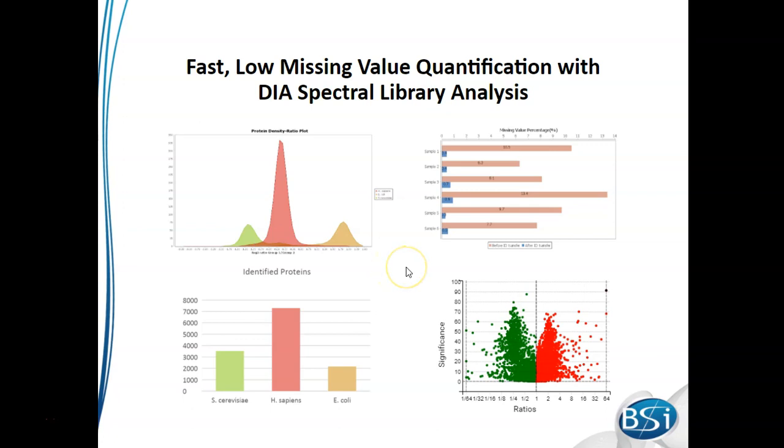An important thing I'd like to point out is that we're also able to limit missing values across the different samples. As shown here, you can see that we're able to keep missing values below 1% in each of the samples.